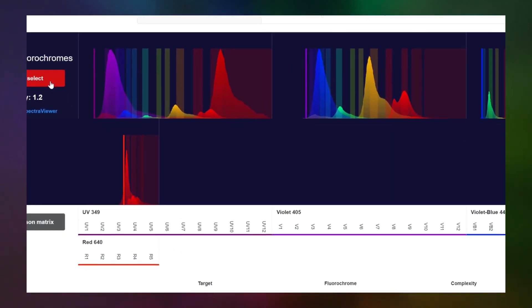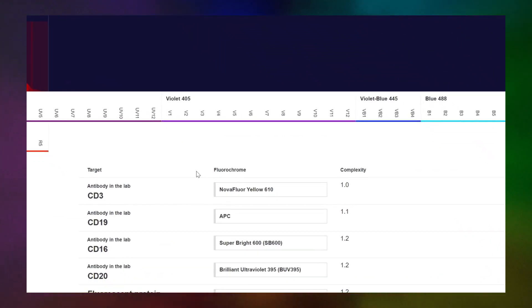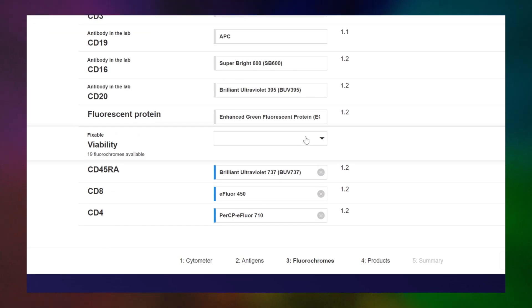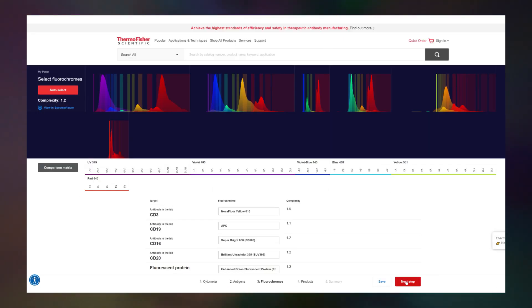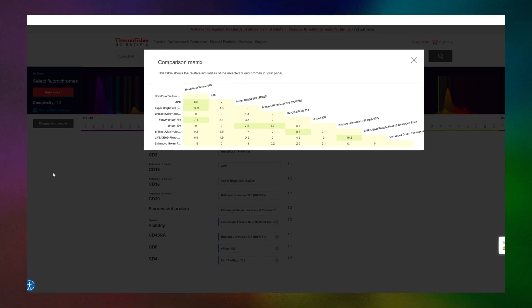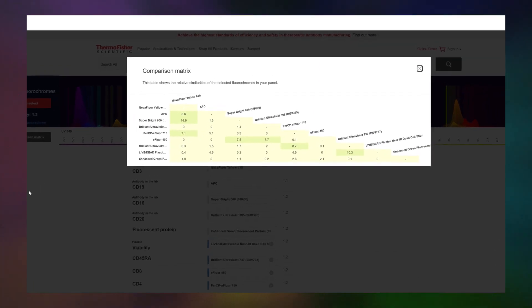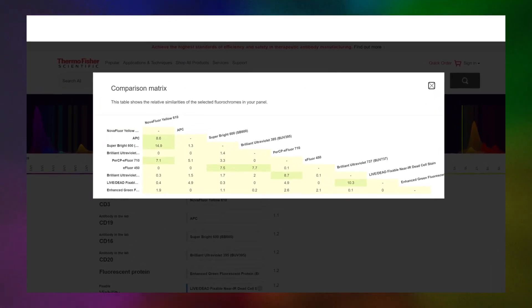The free panel builder tool from Thermo Fisher Scientific helps you to design or adapt your spectral flow cytometry panels. It generates comparison matrices and calculates complexity. As similar dyes are added, the complexity index increases.